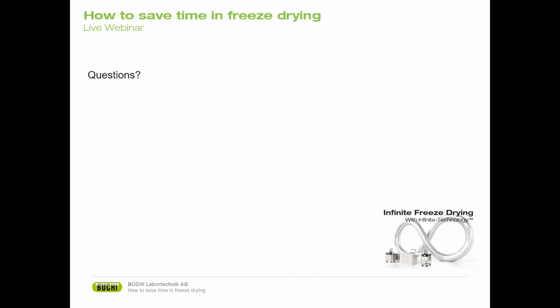As I said, when you have this constant decrease, it's probably better to just increase the waiting time a bit. So when your pressure limit is reached, you then have a longer waiting period because of this longer, slower decrease. But that doesn't necessarily limit your endpoint determination method. Yeah. Okay, thank you very much.